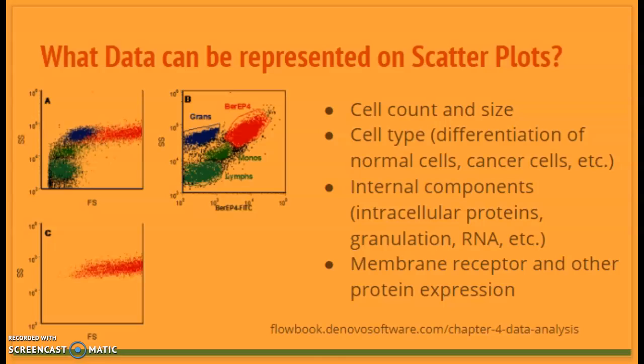Catherine McKinnon says that one way of flow cytometry analysis, the conventional way, consists of drawing a region around a population of cells, that's called gating, and then applying that region to other parameters within the experiment to further select and analyze and narrow the pool of whatever you're looking for. For example, helper T cells can first be defined by CD3 and CD4 expression, and then they can also be analyzed for activation by looking at that specific population for expression of a certain activation marker or perhaps a cytokine production.